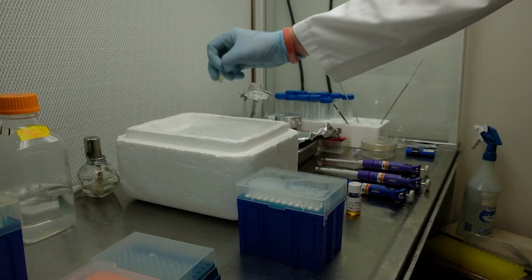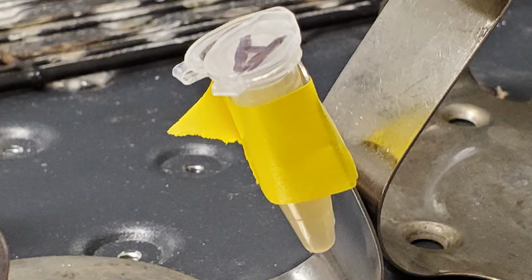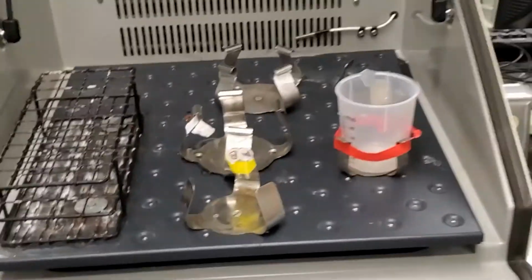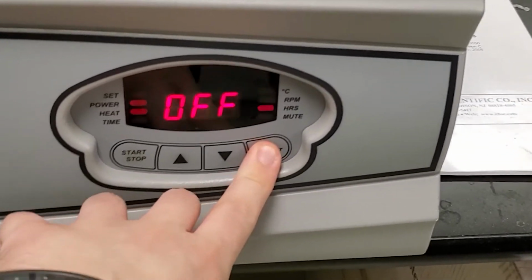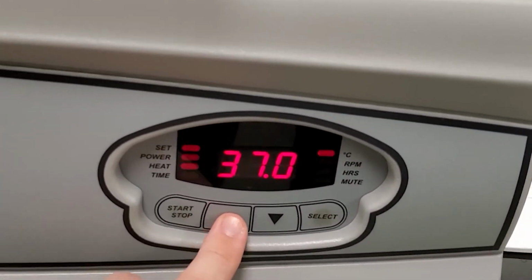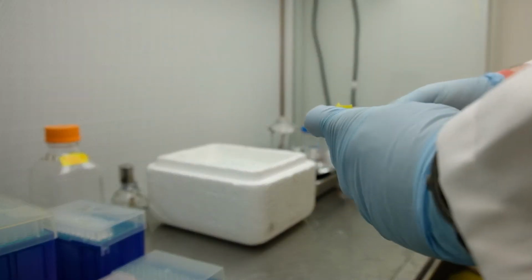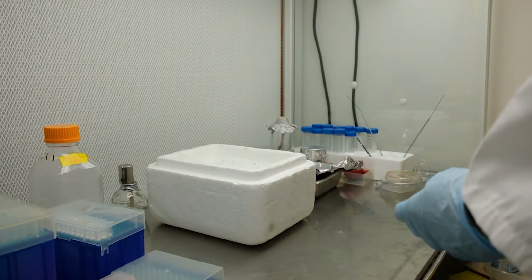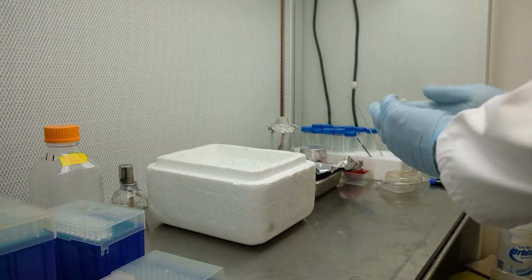These cultures will need to be outgrown in a shaking incubator. If the incubator you're using doesn't have racks for microfuge tubes, then just tape them up somewhere inside at an angle. Set the same temperature and RPM as before. Take your cultures back to the laminar flow hood and put them on the ice.